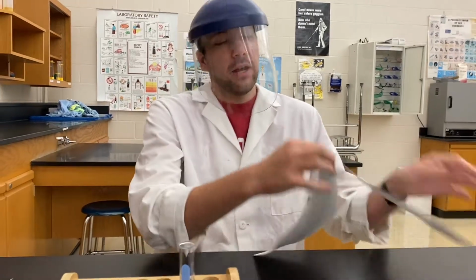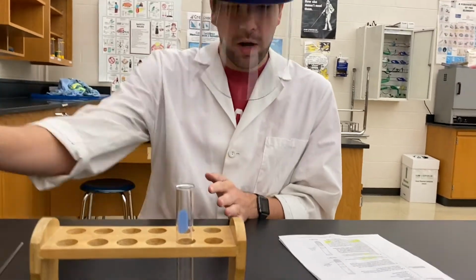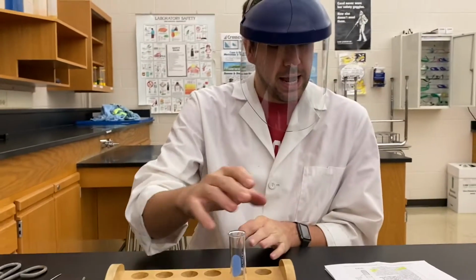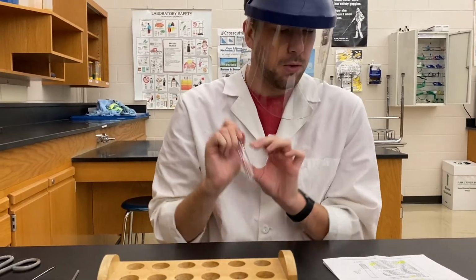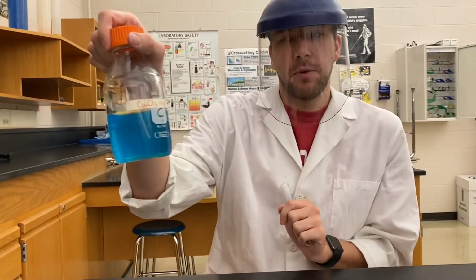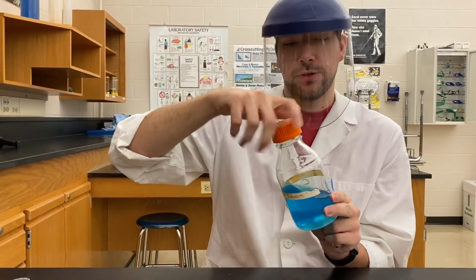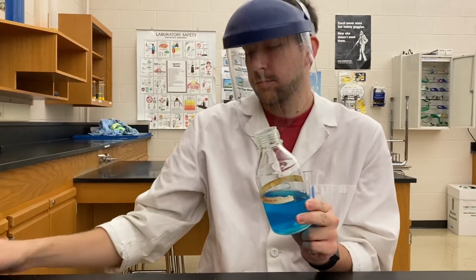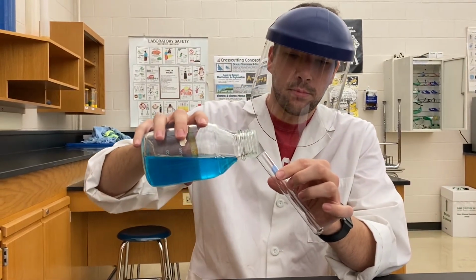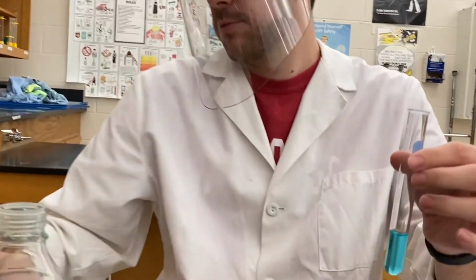So, to get us started here, I'll go through the steps. We have our water bath heating. We're going to use that a little bit later. And I'm going to start by adding a little bit of 1 molar copper 2 nitrate to this test tube. You'll see here that the copper 2 nitrate solution is a nice blue color. It's a little bit too much, but that's okay.